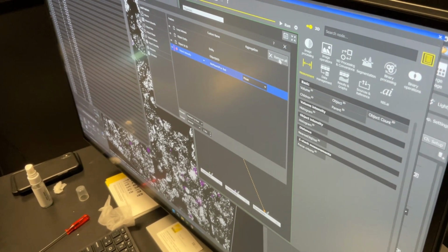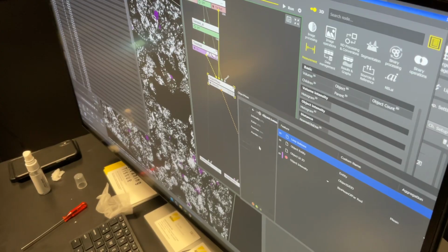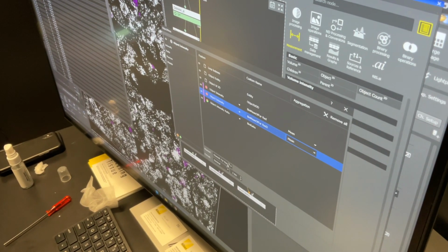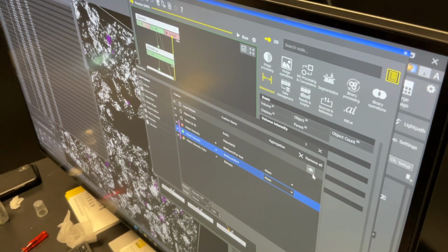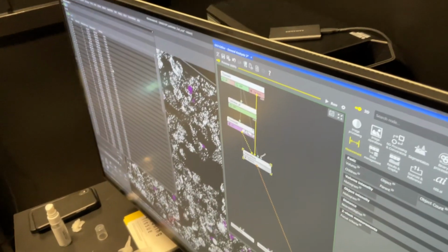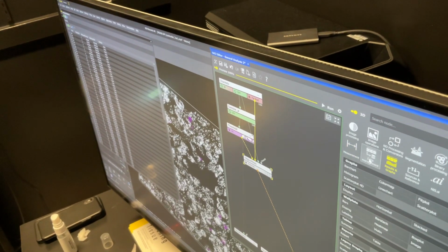And then I'll actually have two channels, so I'll do ratio because it'll be blue and yellow. But I don't have that image yet. So for proof of concept again, it would just be ratio, and I'd probably throw in the standard. So I'd have red, far red, let's see, it's GFP. Then I'd have my individuals and my ratio, and then I can always backtrack my calculations. And there you go. Super straightforward, super simple. That's not bad. And if that's all you want, you're good. If I wanted to count the, I guess, is it?